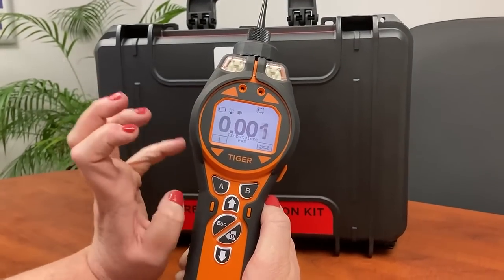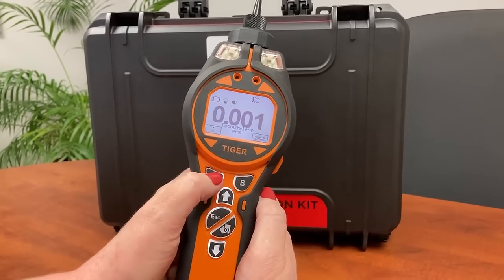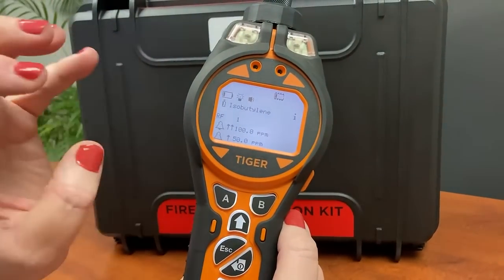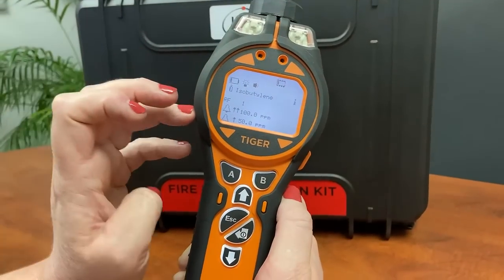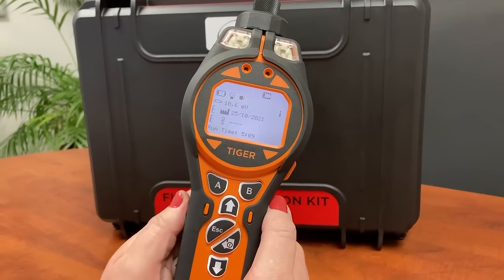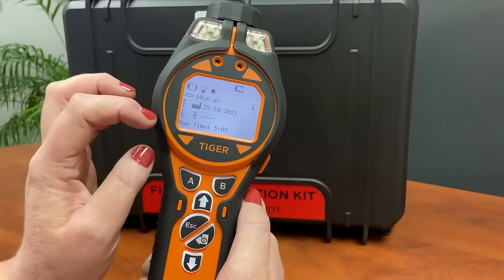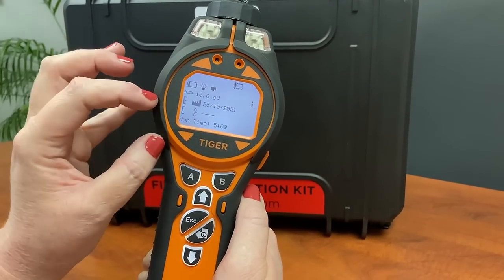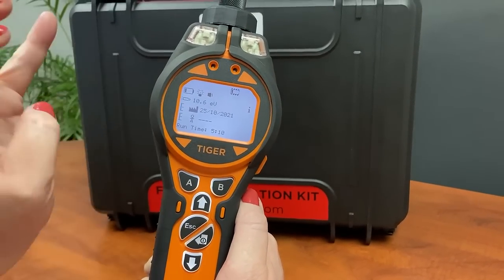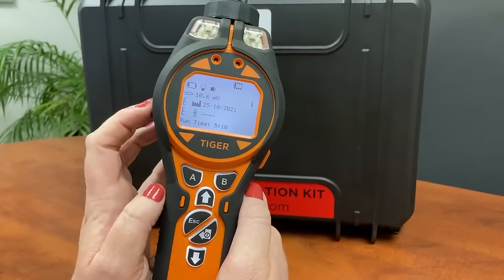This is isobutylene, in parts per million, although this instrument is a PPB model. The most important button to start with is our information or I button, which gives us a summary of the instrument and how it's been configured. Currently it's set to isobutylene with a response factor of one and upper and lower alarm limits. Scrolling down, we've got a 10.6 lamp and a calibration done at the factory on the 25th of October. If you did your own bump test or custom calibration, this date would overwrite the factory calibration — we'd never advise fiddling with that.